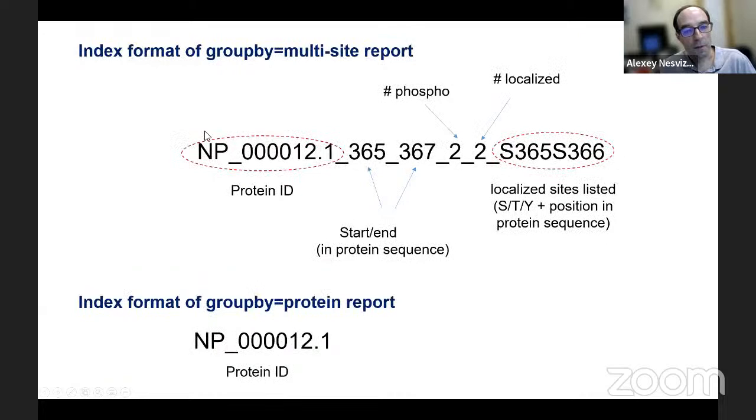And here is some information about how we generate those indices. In the case of phospho data, I don't think we have phospho really. I'm not going to explore that as part of the hands-on that Felipe will do with Finchao. But all of this is described on our website. So we generate PTM level reports, where in a multi-site report, we keep all configurations: localized, unlocalized, partially localized.